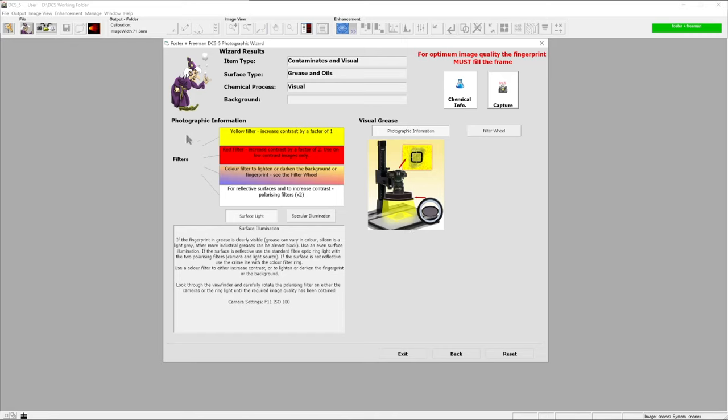What will finally open up once you've made your selection - whether that is a finger mark treatment on a specific substrate type or, like in this case, a visible mark that we're trying to photograph. If you're really unsure, what the wizard gives you is options for the photography of these surfaces.